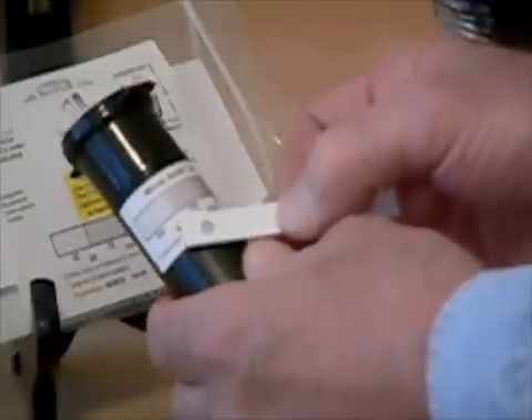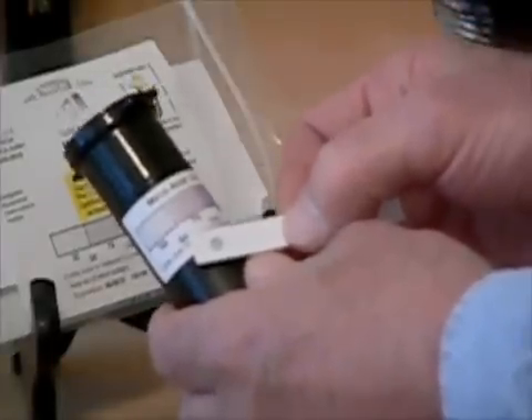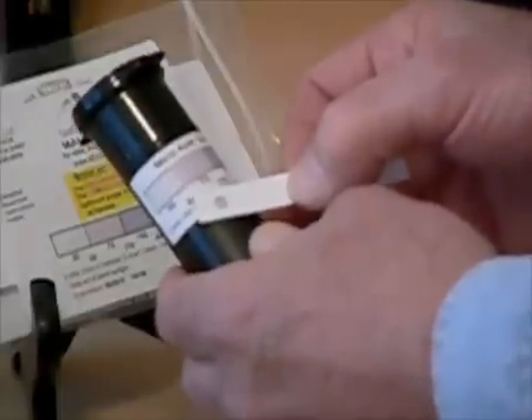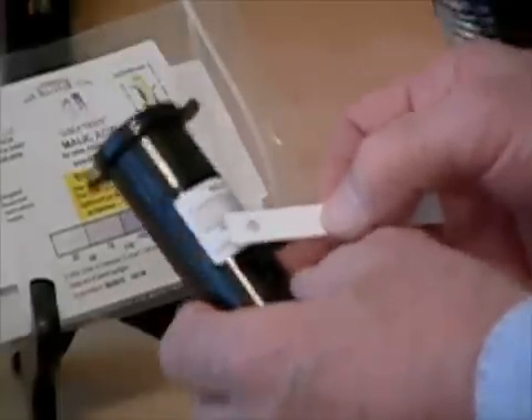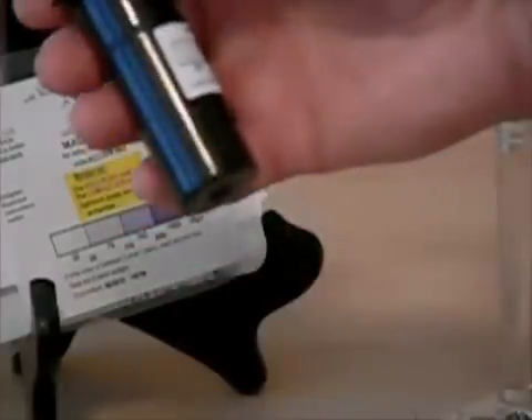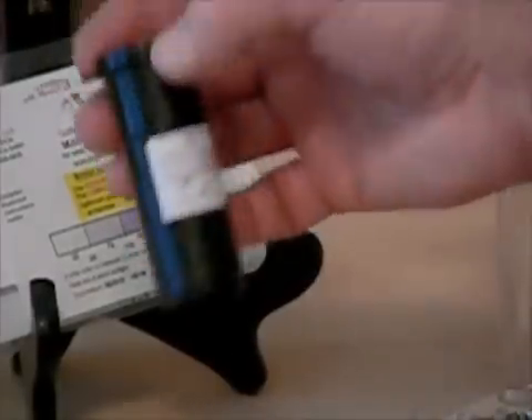Wines in the 30 to 75 milligrams per liter malic acid level are usually considered as having completed MLF. Sometimes a wine will have no malic acid level and the color will actually be white and below the 30 level. That's it. Give our tests a try — you'll like them.